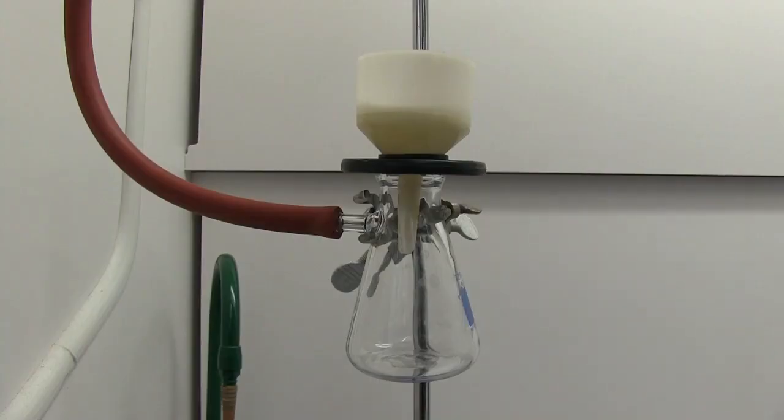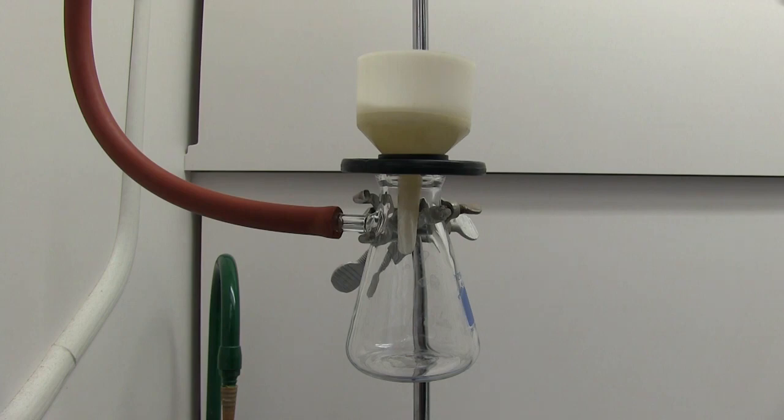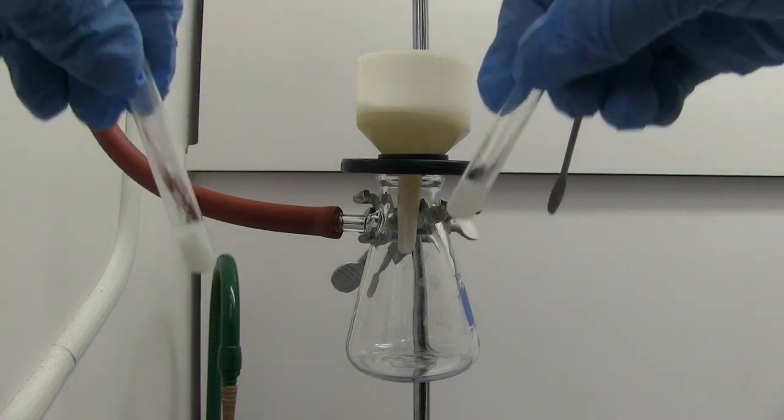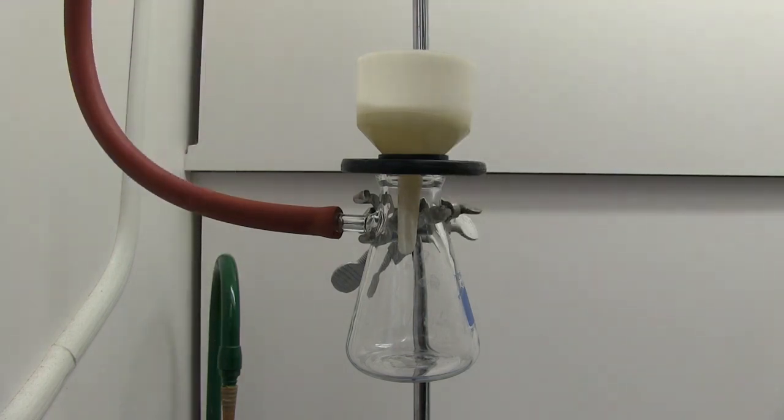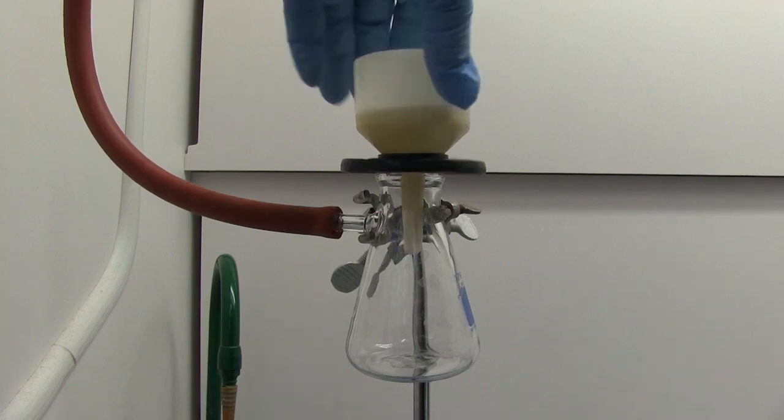Alright, so I'm now going to vacuum filter or I'm now going to filter off and collect our caffeine. Both of my recrystallization test tubes look similar so I'm going to combine the product and then, it's not part of the experiment but I'm going to test with IR just to confirm that it is caffeine.